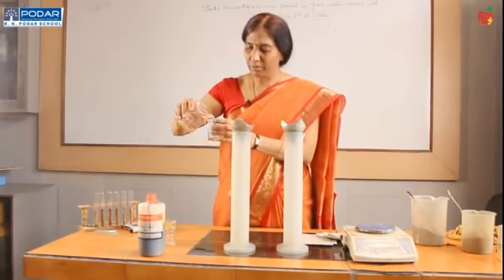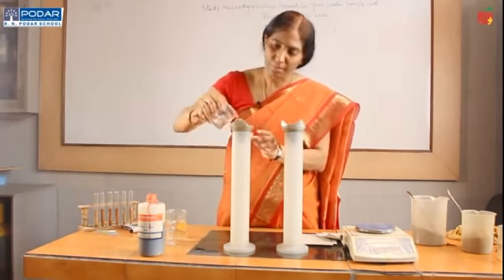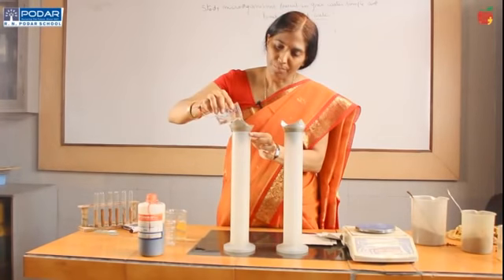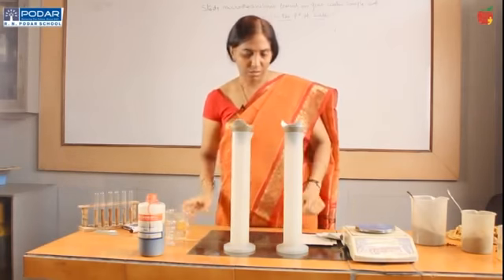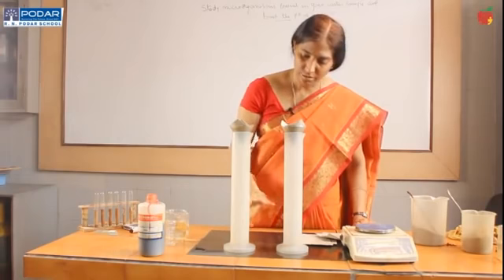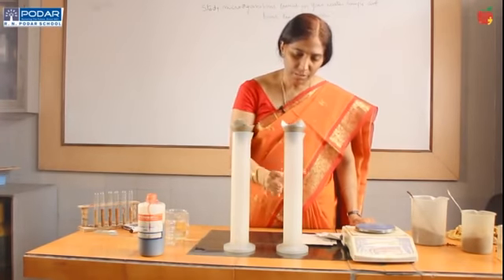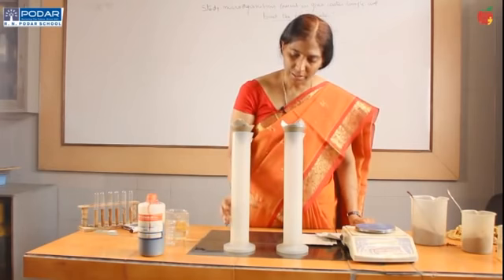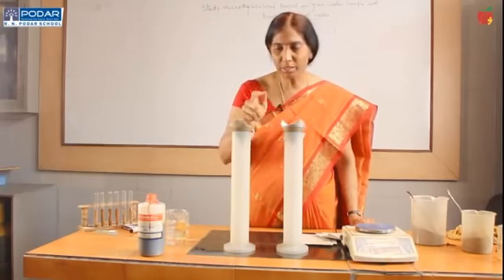Again 50 ml into the second cylinder also. After 10 to 15 minutes, water will be collected in the measuring cylinders. Then we can find the difference, which cylinder has more water and which has less. That will show the water holding capacity of the soil.